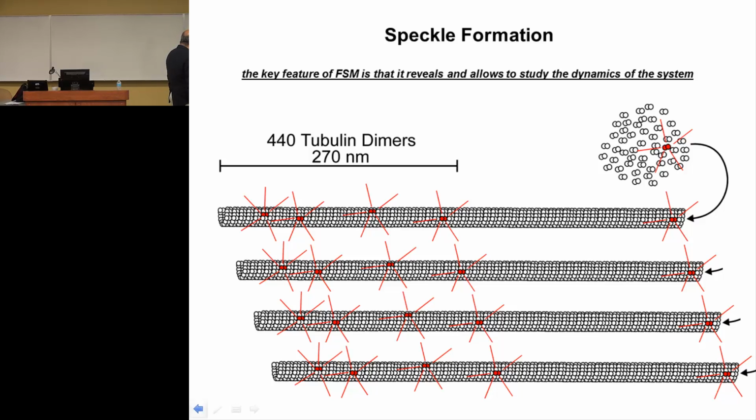So this is one rigid structure. If you have something here and here, they're going to stay constant throughout. But these two, even if they're next to each other, they can slide by molecular motors. So there is some sort of coherence, but not completely, because this here is 25 nanometers, and the cutoff of the resolution is, let's say, 10 of them.